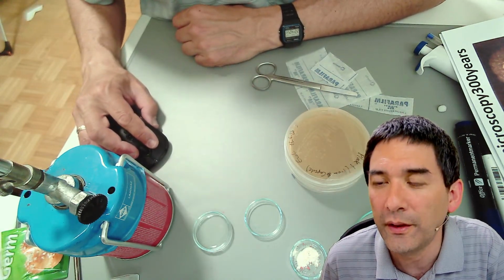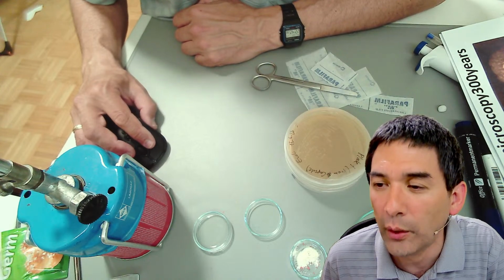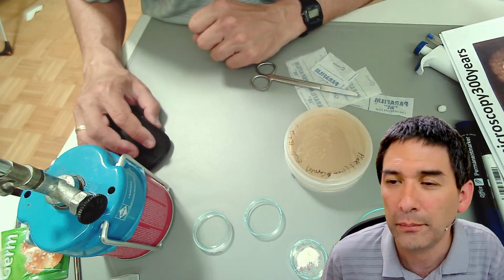I've seen a video with 100 times phase contrast with and without oil, and I've seen that no oil drastically affects phase contrast. Yes, you need oil for resolution. I have not used oil now because I didn't want the mess, but it still worked.